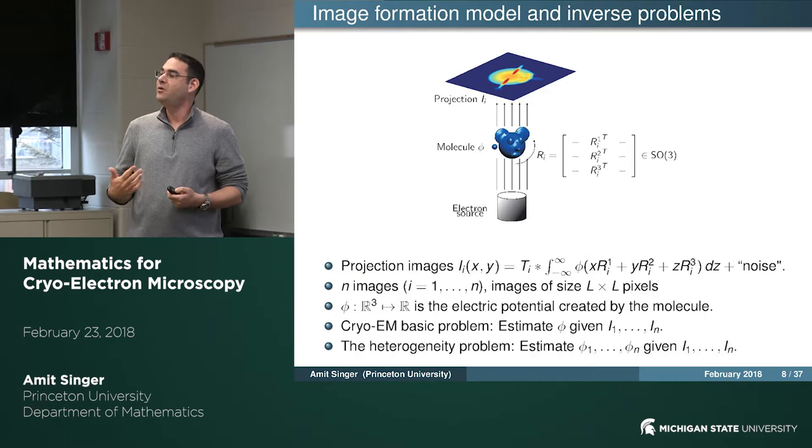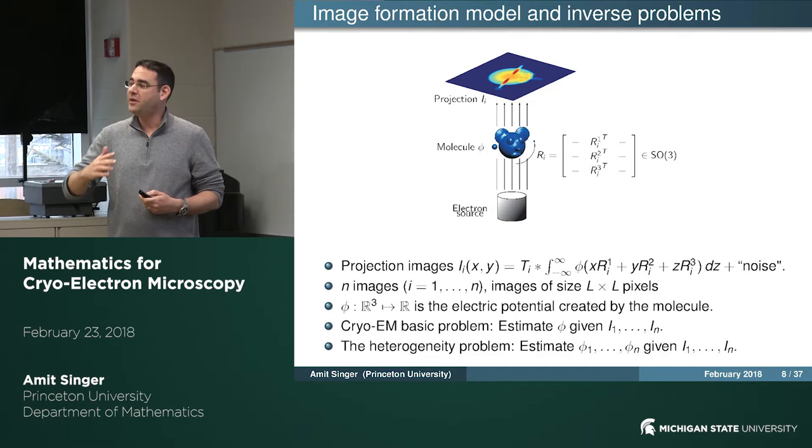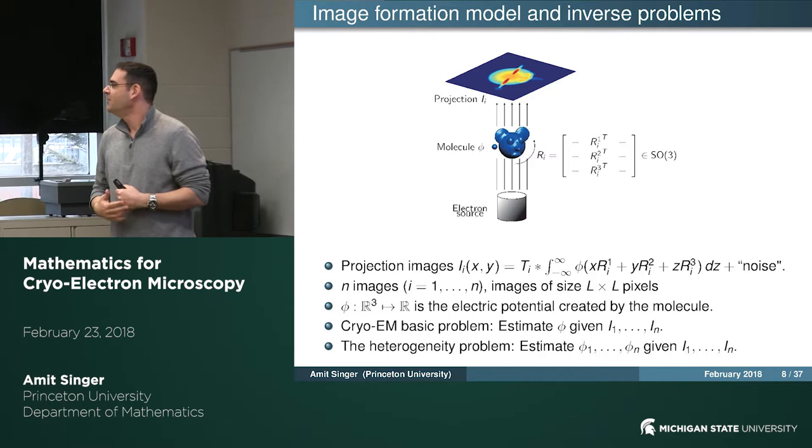And so in practice, the most widespread technique is called single particle cryo EM. In single particle cryo EM, you just use a single tilt, like no tilt angle. Okay, and then you just have one image per particle. And these are the rules of the game that we need to address today.